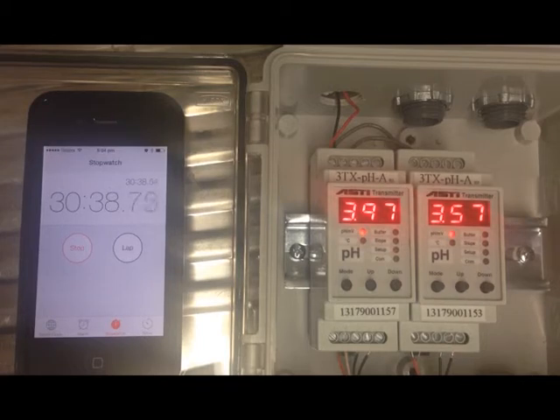That incorrect calibration, when we calibrated when our sensor was at 50 degrees, when the solution was actually closer to 20, is almost half a pH unit. It's quite a big error source. It's something we want to try and keep an eye out for. It's something we want to try and compensate for.